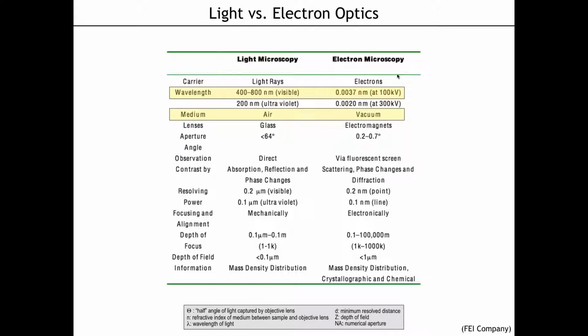This is mostly due to a number of reasons: imperfections in the lens systems, the amount of noise in the digital images that we're recording, and so forth.